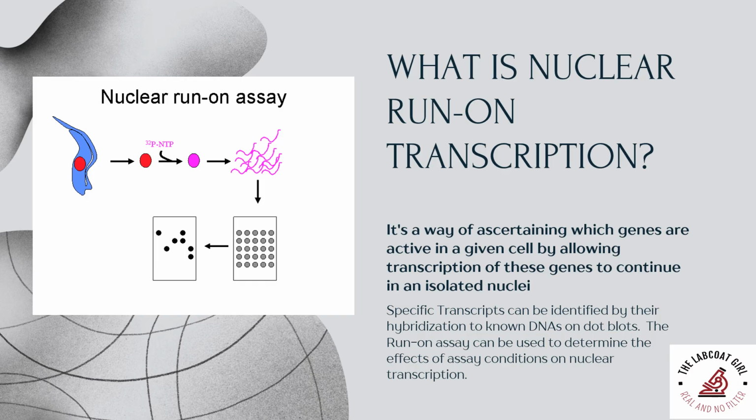So to eliminate any possibility of initiation of new RNA chains in vitro, which does not happen usually, you can still add an anionic polysaccharide, for example, heparin, which will bind to any RNA polymerase if present, and it will prevent the reinitiation.